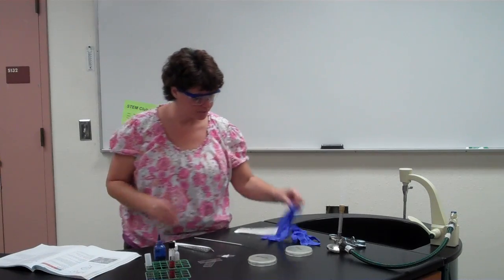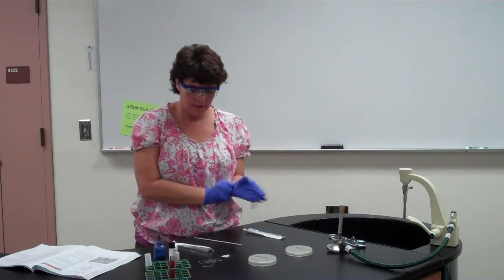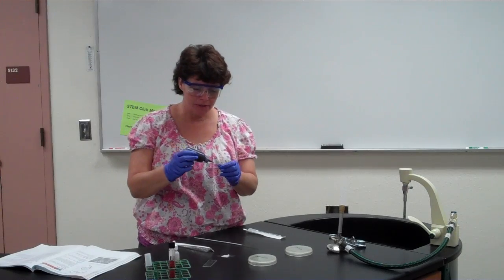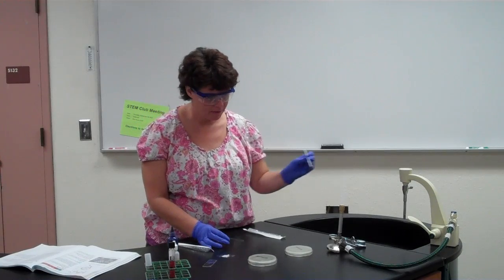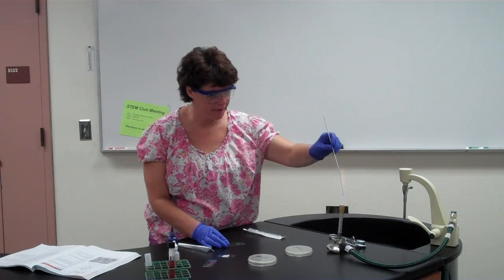Okay, so the first thing that you're going to do is you're going to make a wet mount, just like you did with the protozoa, but this time you're going to do it with the yeast. Okay, so this time instead of putting water on the slide or anything for your wet mount, you're going to use this lactophenol cotton blue solution. And so it's going to be a light blue color, and you just put a small drop. It says a couple of drops, but 1 is fine. And then you're actually going to take a loop full of the yeast from the plate.